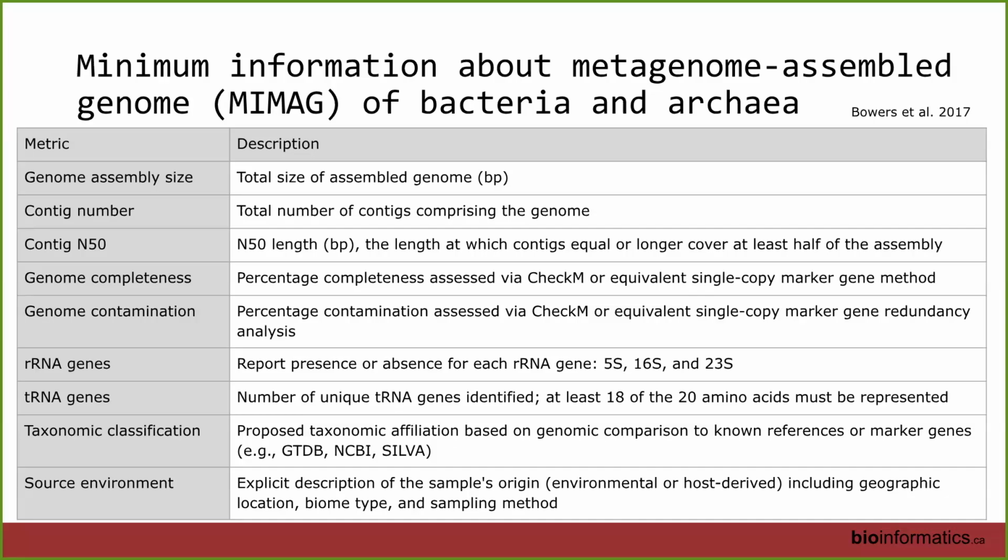However, you can absolutely get better bins with that protocol or that strategy. And when we're doing bin refinement at the end of the actual lab, you'll see a circular plot, and I'll show you what those look like soon. It will show you how you can actually refine a bin based on the coverage that you see. And it's surprising how much variability a binner will think is the same organism. That really has to do with strain heterogeneity, at least in the case of today.